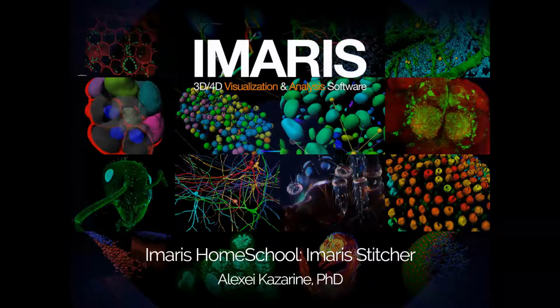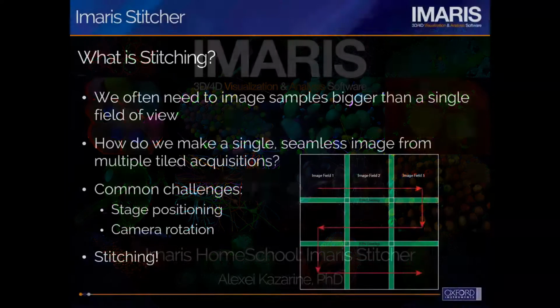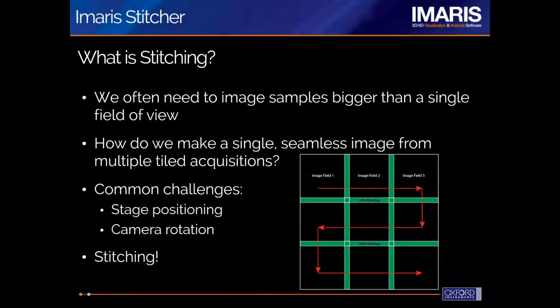Today I'm going to be showing you how you can use Imaris Stitcher to effectively stitch your tile microscopy acquisitions. So let's get started. First, I want to introduce the concept of stitching as well as the stitcher itself. We'll then go directly into the software where I'll be able to show you how to easily stitch different kinds of data.